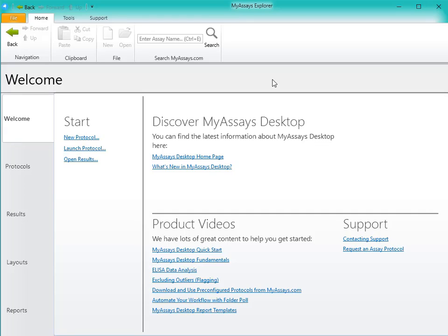MyAssays Desktop has several pre-configured protocols for commercially available ELISAs, but there is also a general ELISA protocol included that can serve as a template, allowing you to make changes to quickly adapt the protocol to fit your needs.